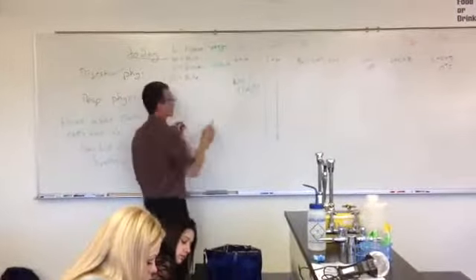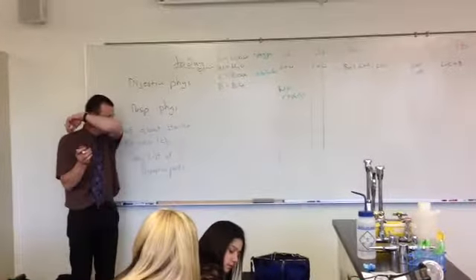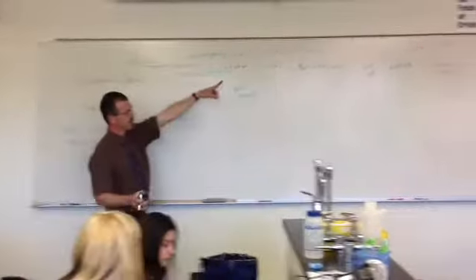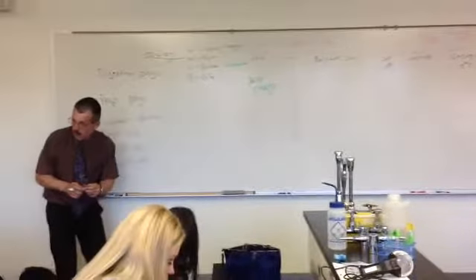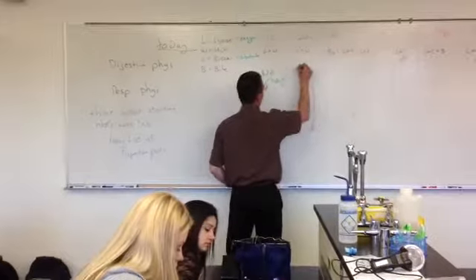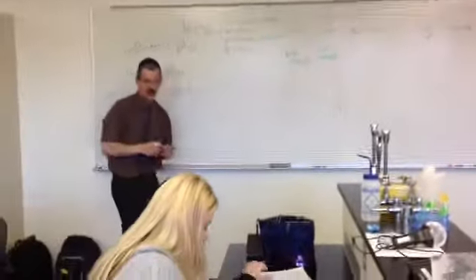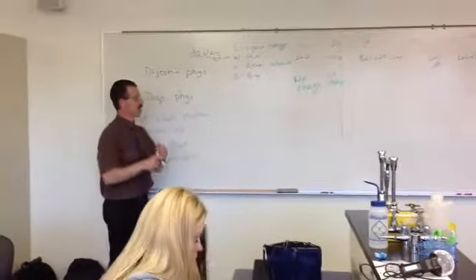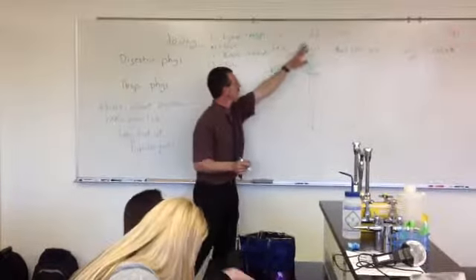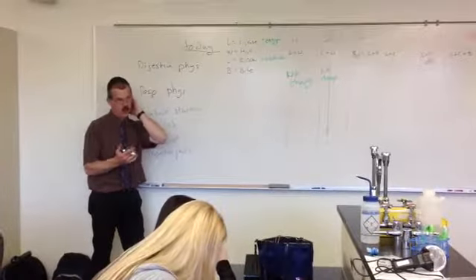Cream was the substrate. If I don't have a substrate, I can't make product, therefore I don't do anything, right? So we don't expect color change. Number 2L. Did it change color? No. Tell me why number 2 did not change color. No enzyme. I have a substrate, but I don't have an enzyme to break it down, so nothing should happen. These are your controls, right?